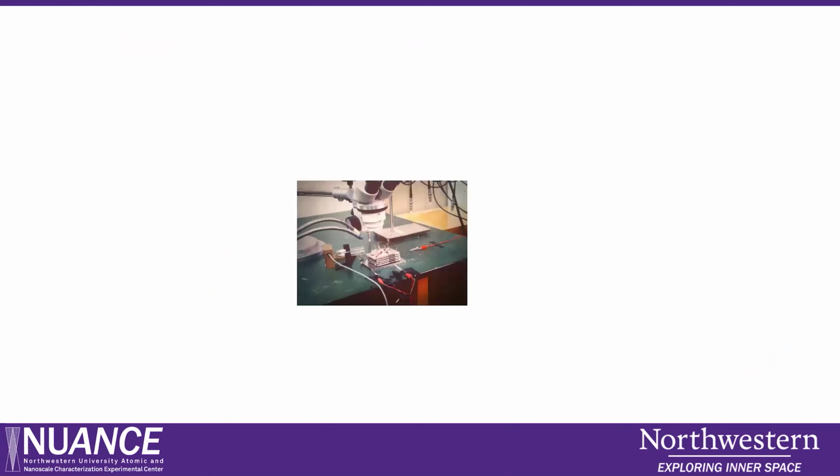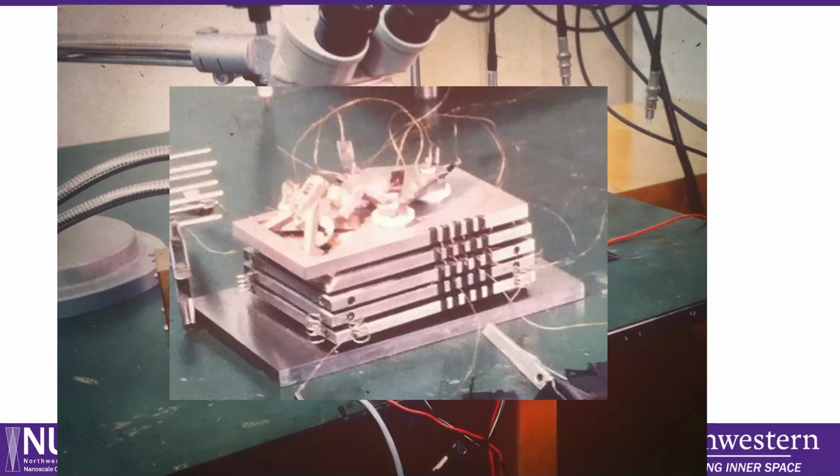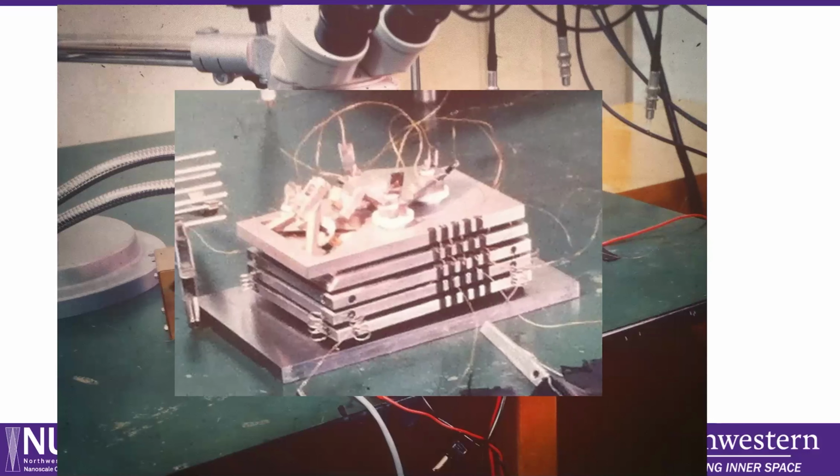If you look at the AFM 40 or 50 years back, this is a typical AFM that was developed by the original inventors. You can see here a bunch of wires, and there's a probe there that interacts with the surface. So this is basically a handmade scanning tunneling microscope. The connection looks very hard to figure out, which is the probe, which is the sample.